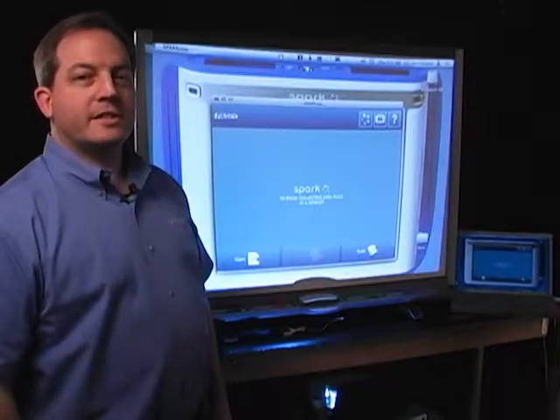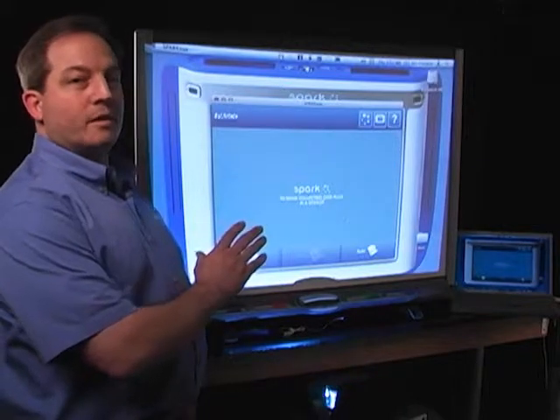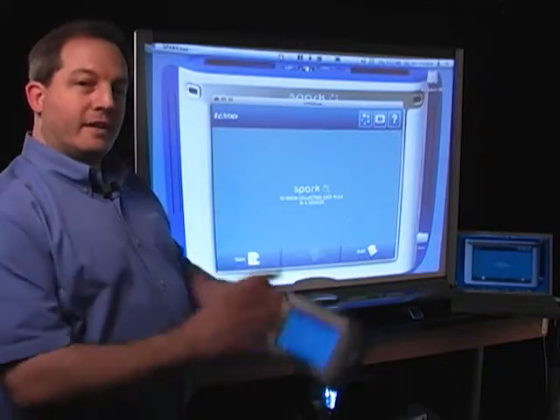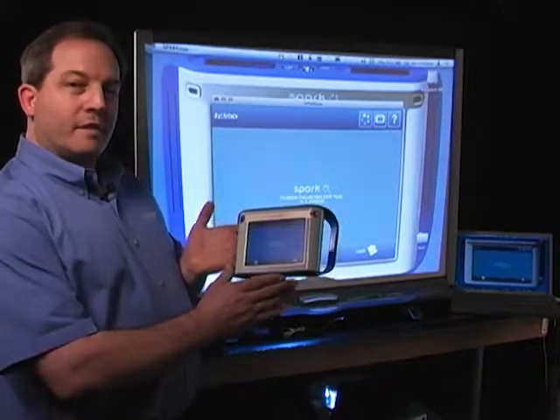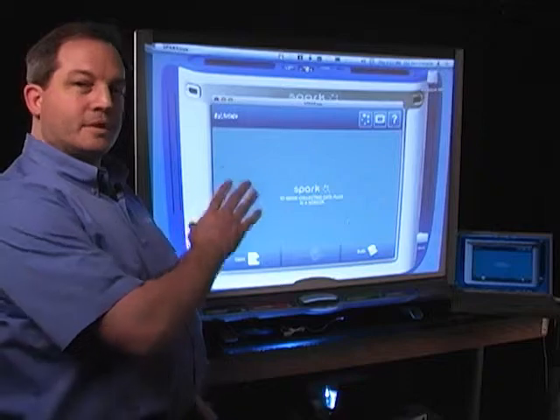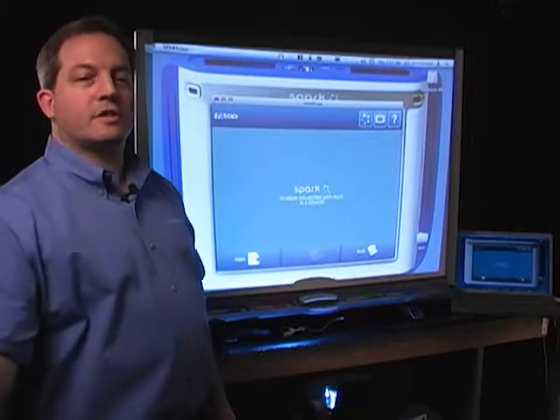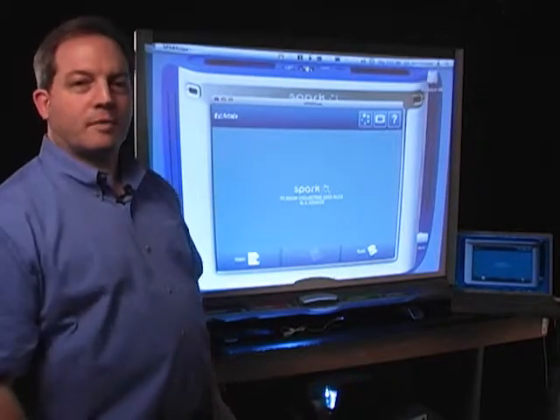Hello and welcome. Today we're going to take a look at using SparkView software to get the little screen of the Spark Science Learning System onto the big screen of the computer so you can use it with your entire classroom.